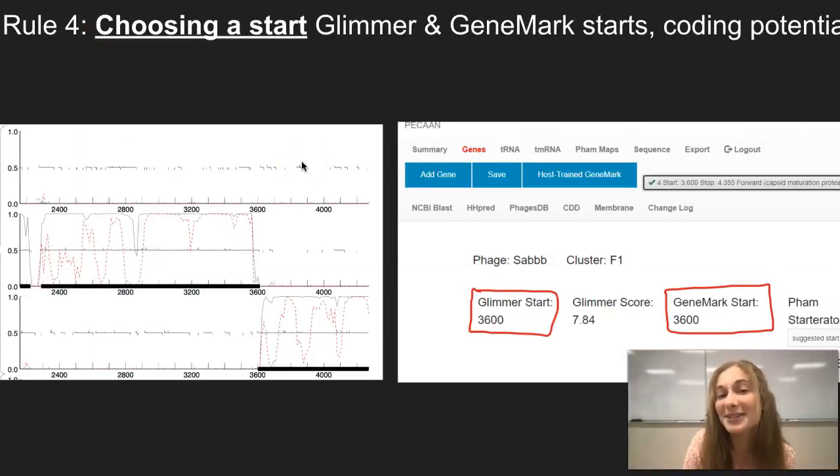Rule number four helps us choose a start through different databases like Glimmer and GeneMark. On this screenshot of Pecan, Glimmer and GeneMark are both calling the potential start for this gene at 3,600. Sometimes they'll disagree with each other and sometimes they'll agree with each other like in this situation. And then on the left, this screenshot is GeneMark.